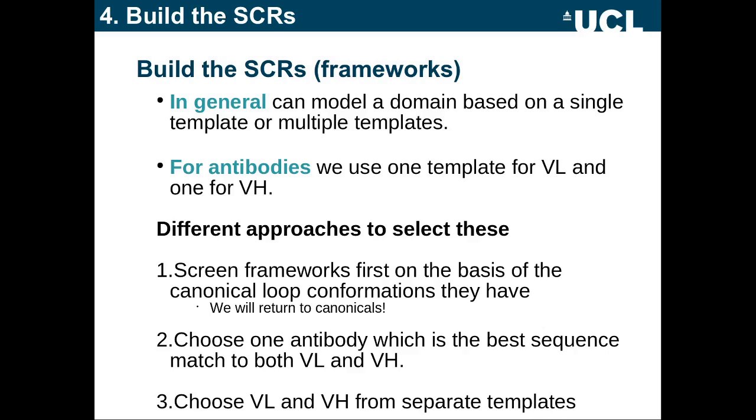So although we are looking at the structurally conserved regions, we can choose which is the best framework based on the loops that they support. And as I said, that's done with this idea of canonical loop conformations, and we will return to that in a couple of minutes.